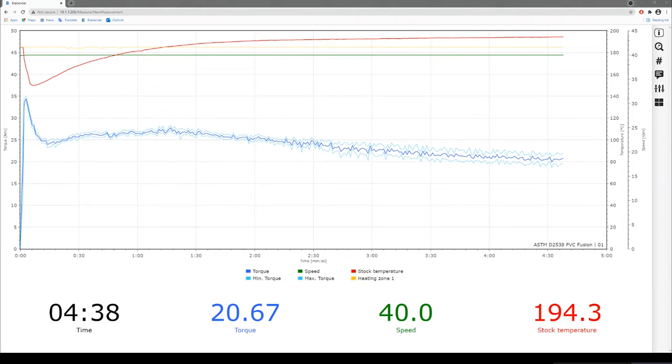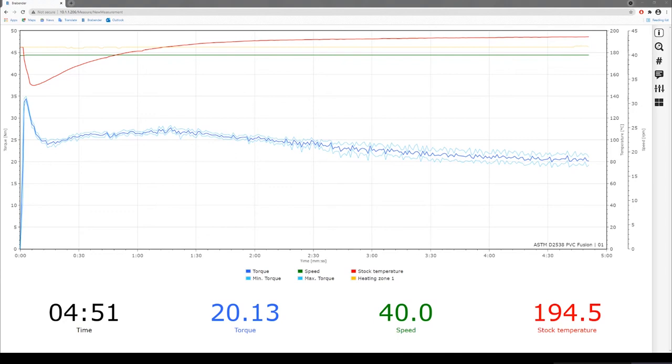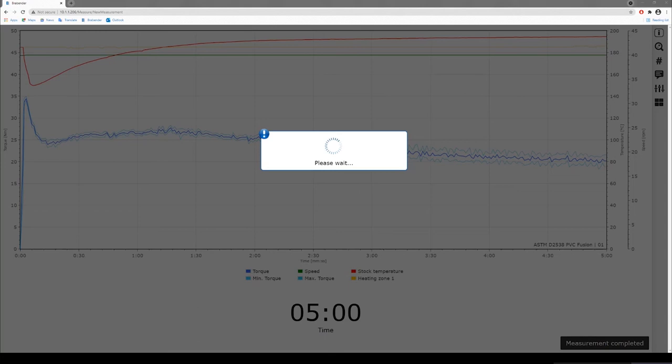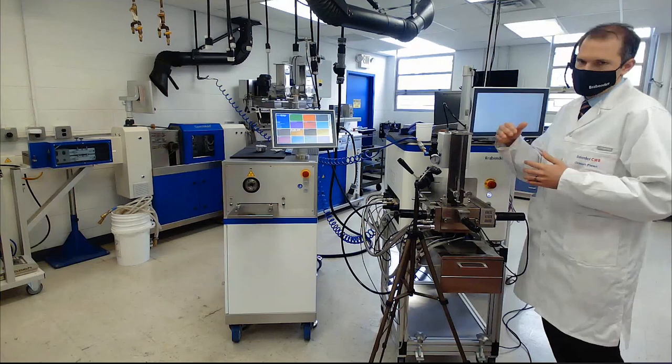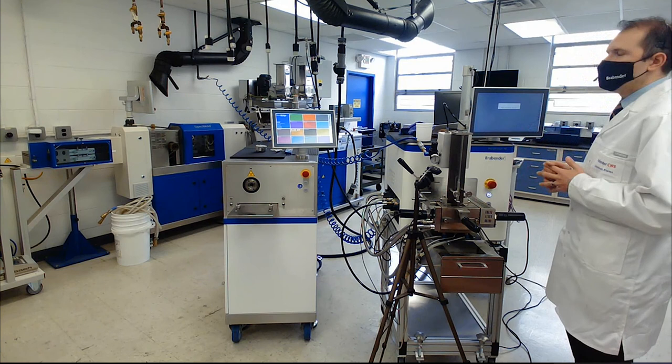After the five minutes, I want to make sure that you see some of the cleaning happening as well, so we will wait until the test is done. We have nine more seconds. The easy thing for our software is if you really like that curve, it is very convenient how you can forward those results or make them into a reference curve. So if you do the consecutive test you immediately see if you're above or below.